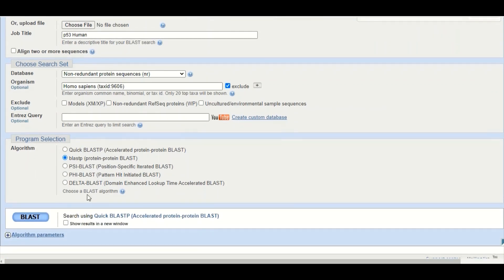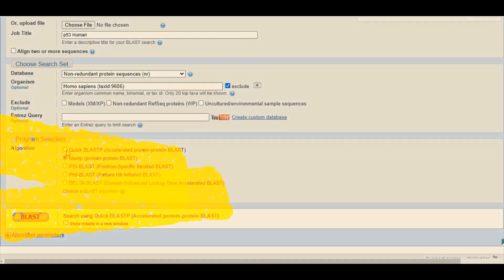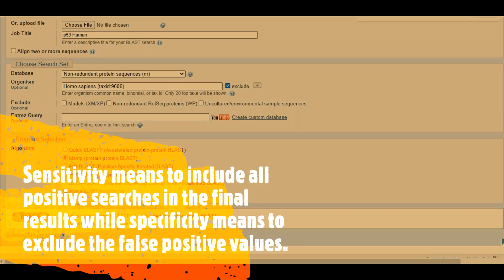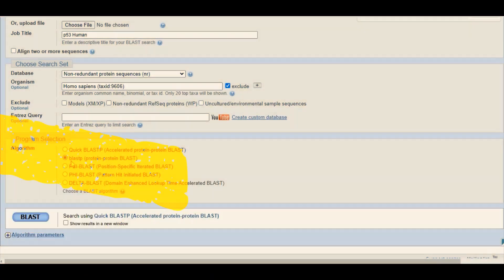At the bottom there are different options: quick BLAST, normal BLAST, PSI-BLAST, PHI-BLAST, and delta BLAST — we will discuss these later in the course. It is highly recommended to use the BLASTP option, which is selected by default. It is not recommended to use quick BLAST because its specificity and sensitivity are normally compromised. If you are in a hurry you can use quick BLAST, but be careful when evaluating the results.